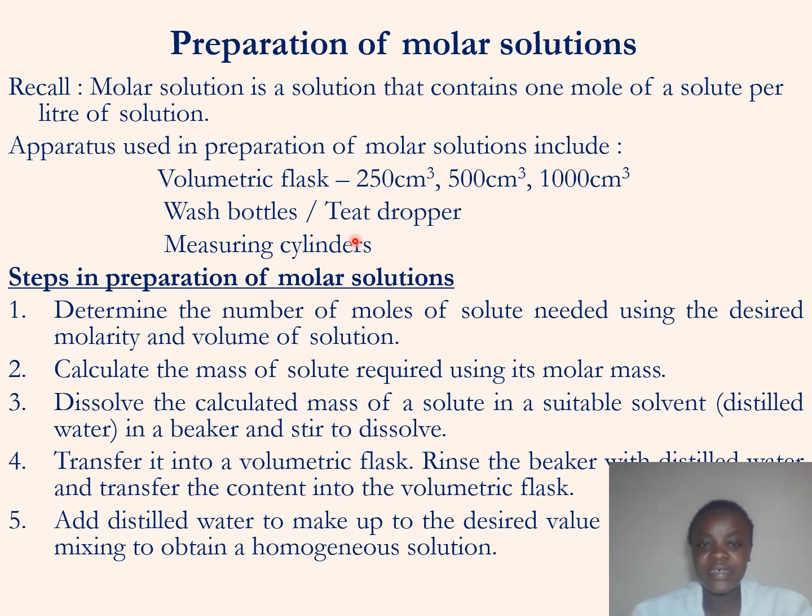Then we will use wash bottles or a teat dropper, and measuring cylinders, also of different sizes.